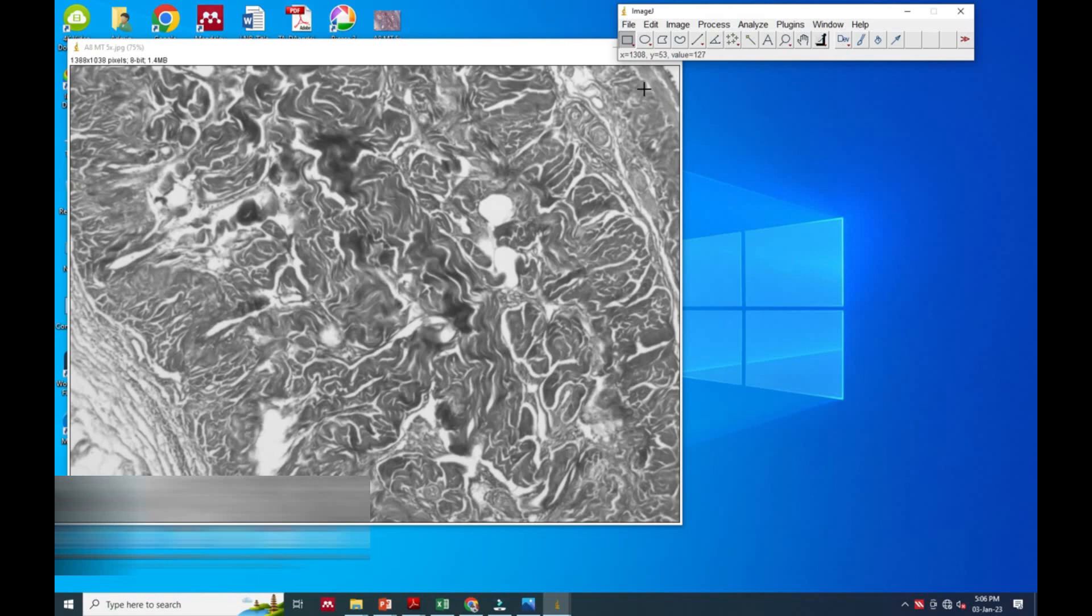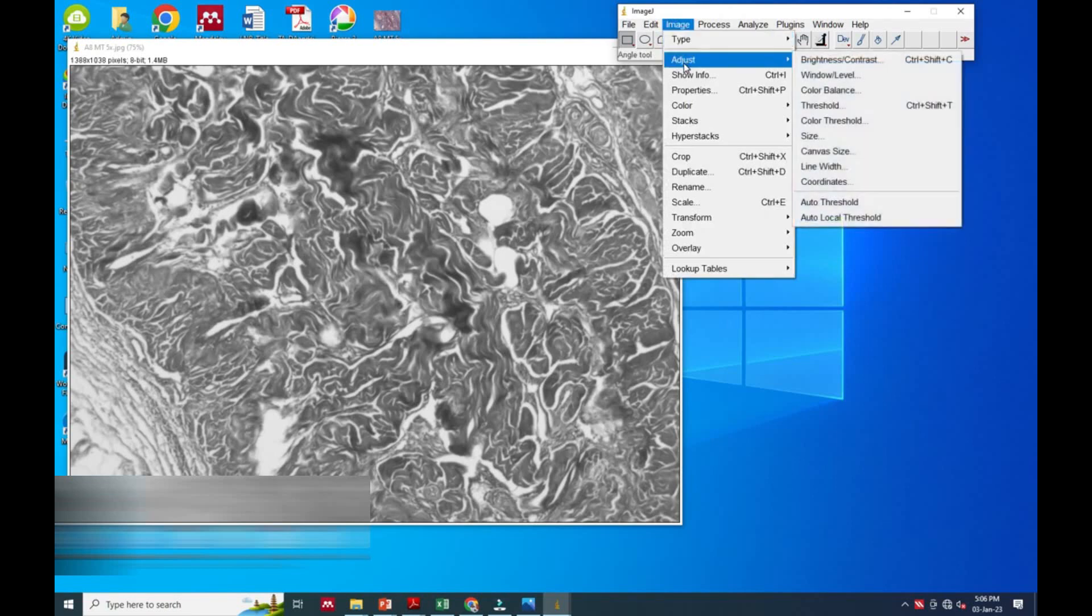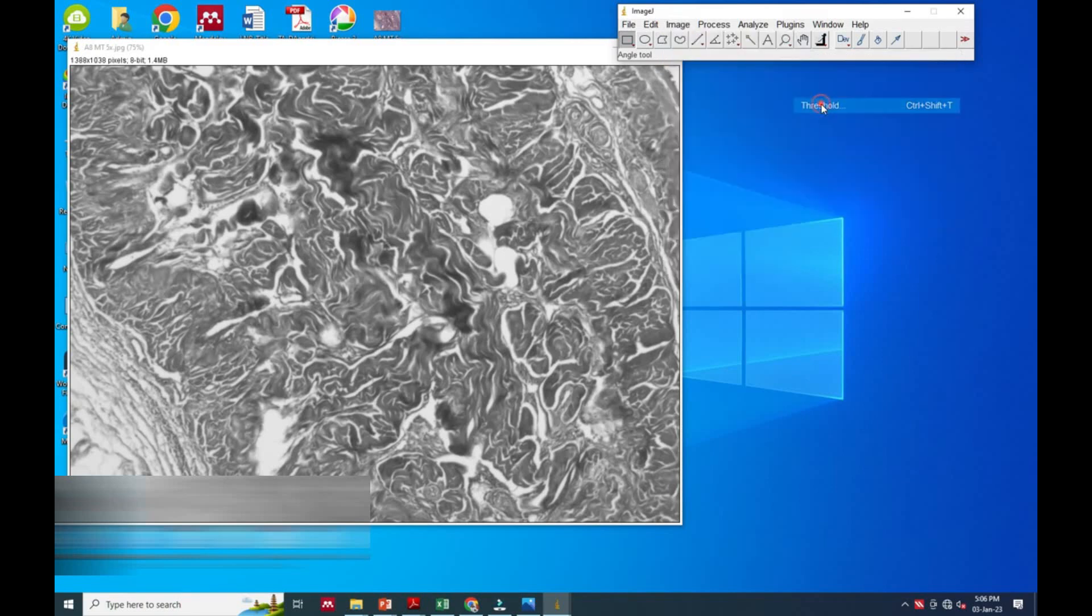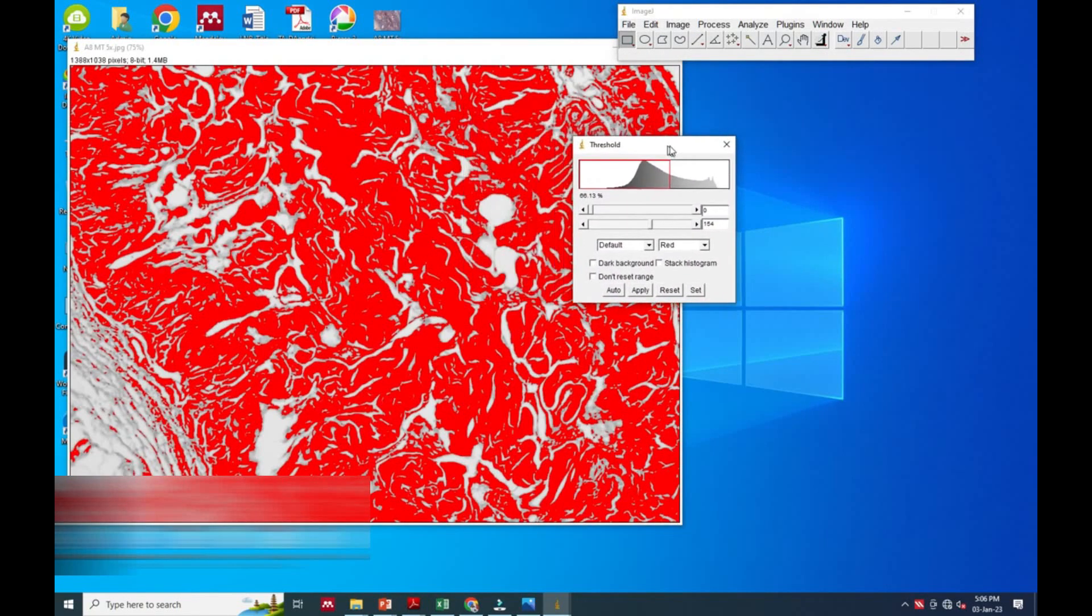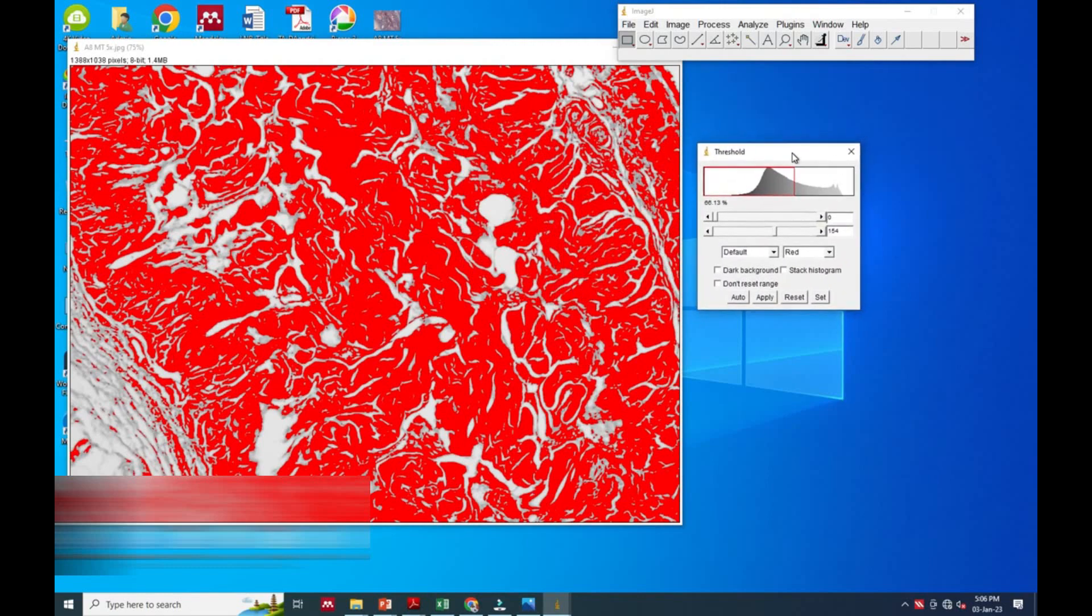Again in the Image option, we will go to the Adjust option, and in Adjust we will go for Threshold. When we click the Threshold it will color the whole area and give one small interface.